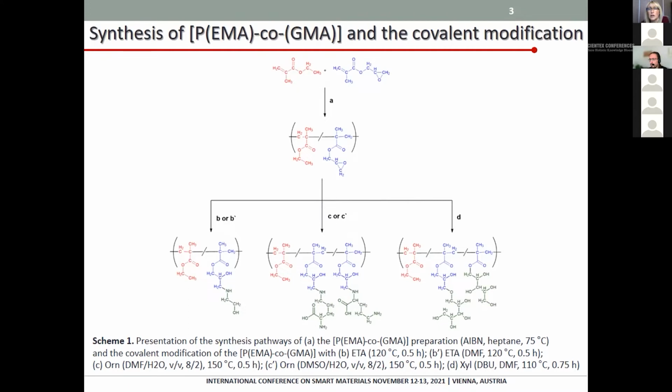The longer chain of the oligomer reduced the solubility of the oligomer in the reaction medium. This process made it possible to obtain an oligomer using precipitation polymerization. The experimentally selected molar ratio of ethyl methacrylate, glycidyl methacrylate and initiator AIBN was 1 to 2.6 to 0.2, respectively. Further, the functionalization of the co-oligomer was performed using a method of post-modification of the co-oligomer with application of microwave-assisted synthesis.